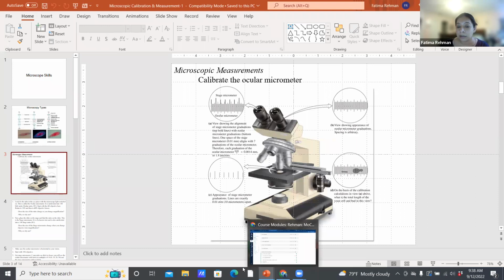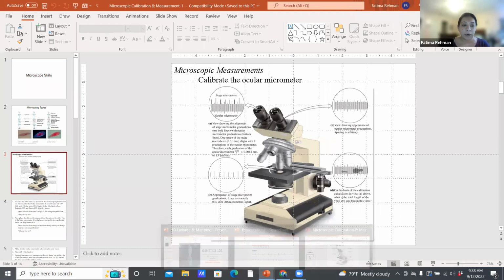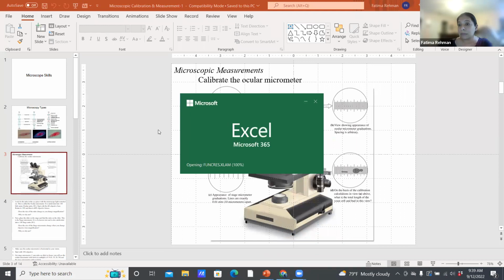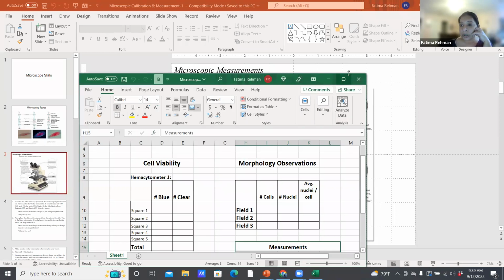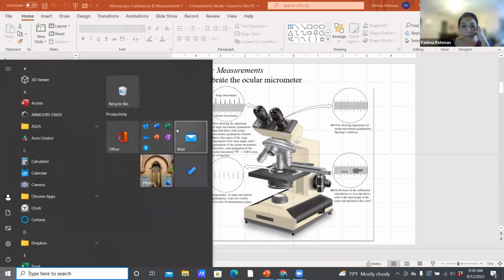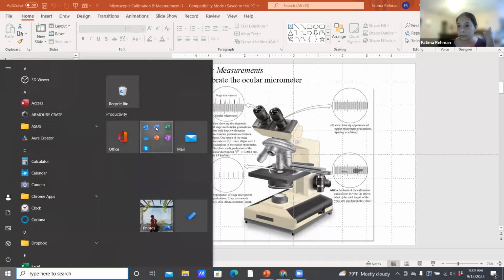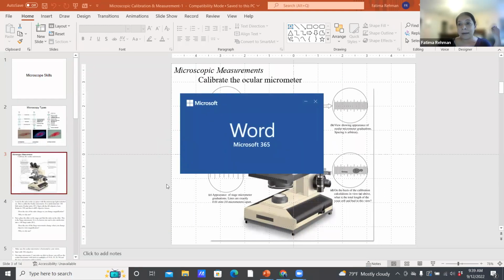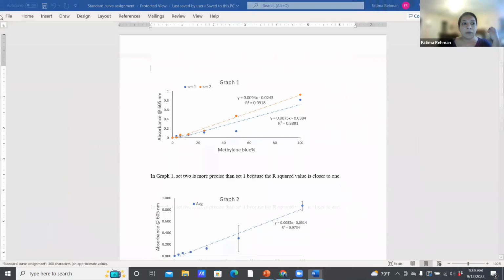And if I know the actual magnification of my image, does that mean I know the size of the image? So it gets bigger, and we know how much bigger it gets from its starting point. But do we know that size by just knowing the magnification? Do we know the actual physical size of the cell? Yes or no? No, right? Because all we can tell from the magnification is how much bigger it got compared to its original size. But we have no knowledge of what that means in physical size of that object.